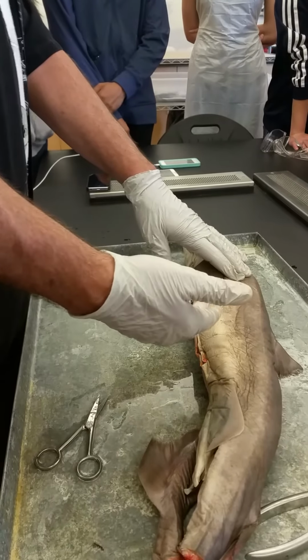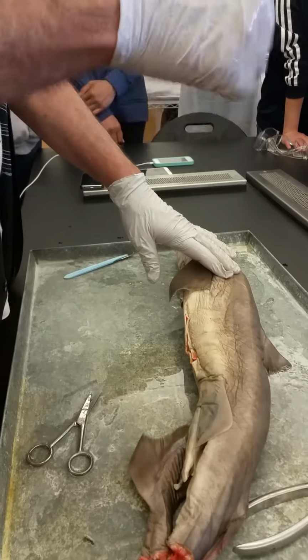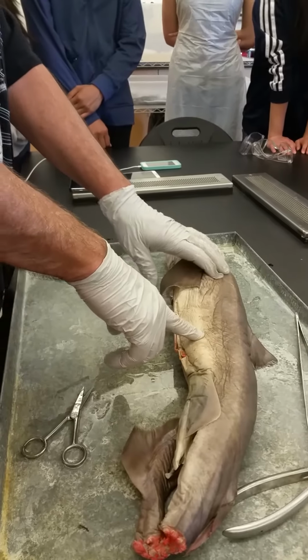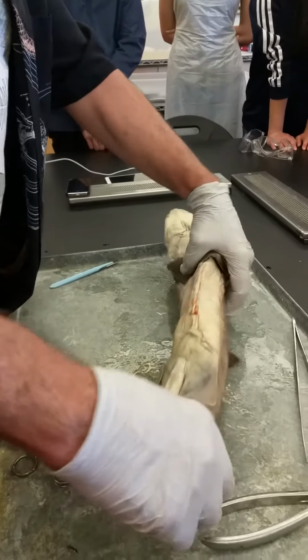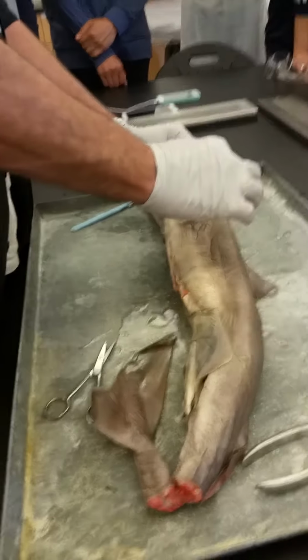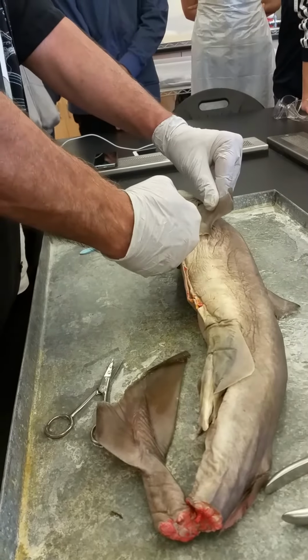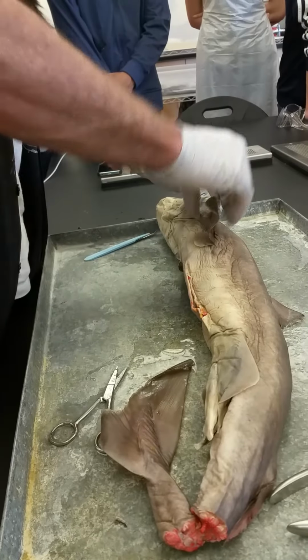If you have internal fertilization, you need a copulatory organ. And so, unlike the bony fish, you can tell males and females by looking for the copulatory organs. Those are located on the pelvic fins. Another difference before that: in the bony fish, the pectoral fins were usually here, the pelvic fins here. In the sharks, pectoral fins here, pelvic fins back here.